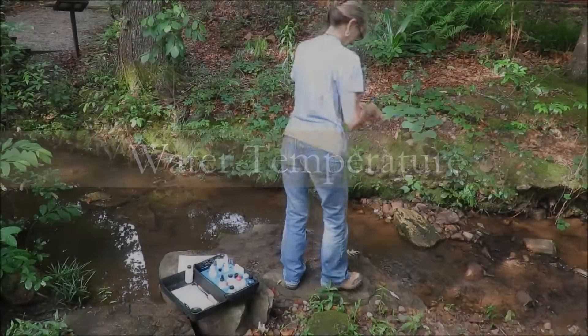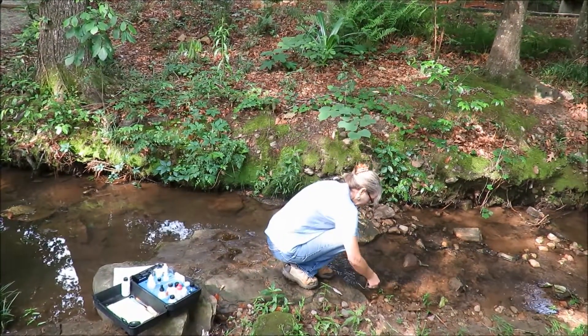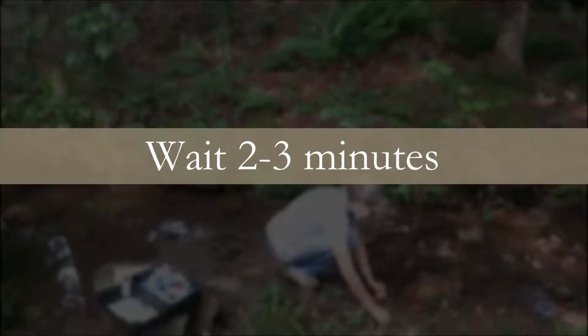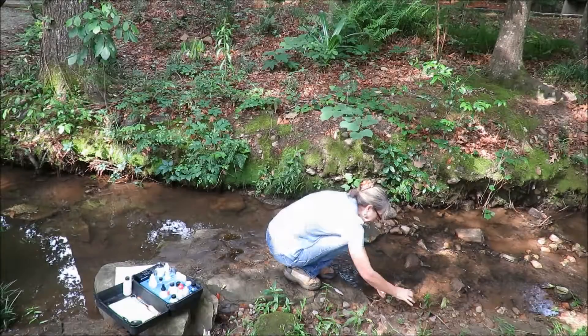For water temperature, submerge the thermometer in the water until the temperature stabilizes, or about two to three minutes. It may be necessary to anchor the thermometer to prevent loss in strong currents, cloudy water, or deep water. This can be done by tying a cord through the islet and attaching it to a stable object.